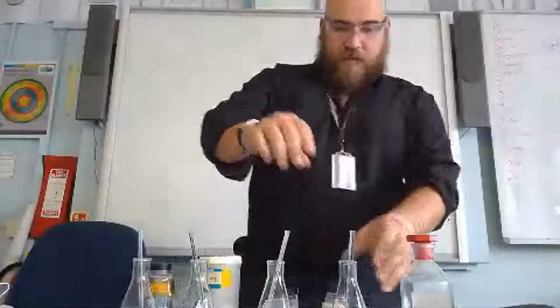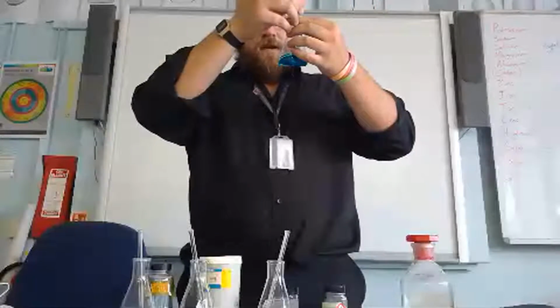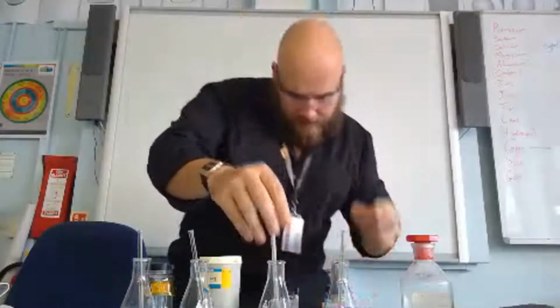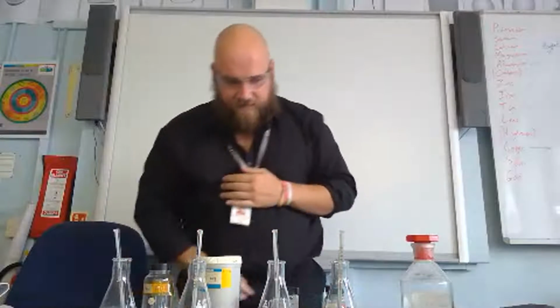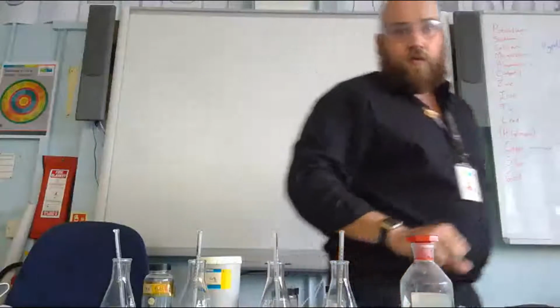So to make sure these are all the same, they've just been sat in the same lab for a while now. So that's reading 19. That's reading 19. Yep, and would you believe it? They've all been sat at the same desk in the same lab. Their starting temperatures are all the same.